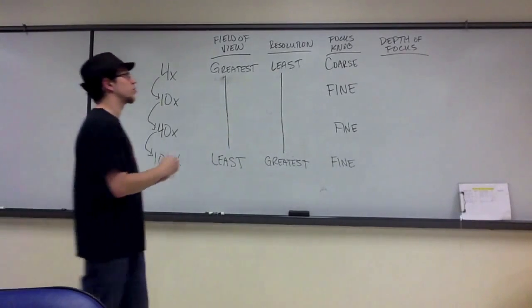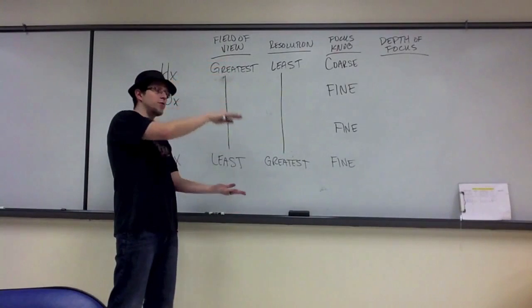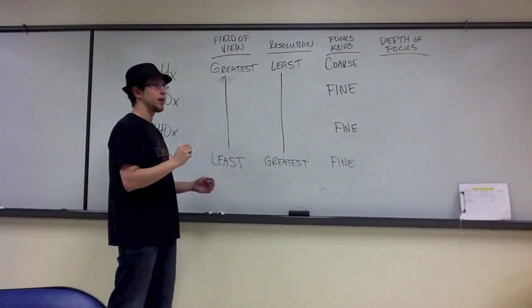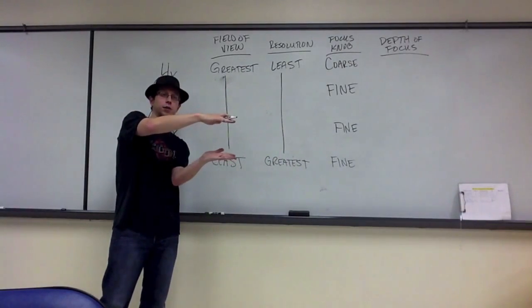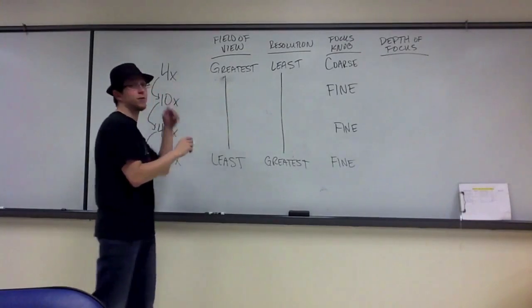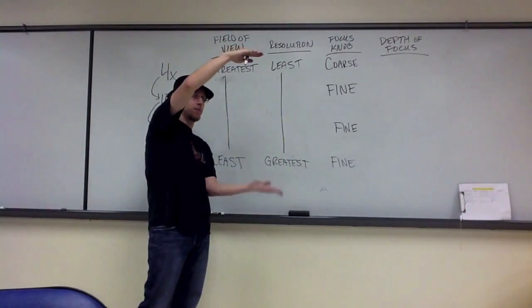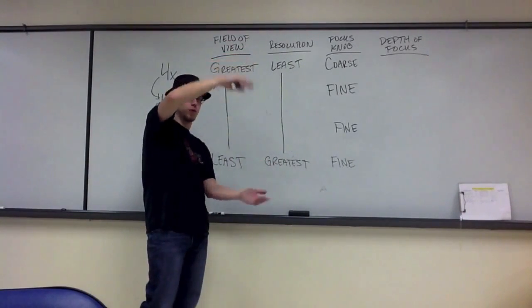Now, depth of focus refers to how much you can move through the slide and remain in focus. So the adjustments you can make to focus while still retaining focus. Okay? In other words, if you think about it, your samples aren't sitting flat. They're actually occupying a 3-dimensional space. So there is some area within that space that you can move using the magnifying lens that will still be in focus. But what depth of focus is asking is how great is the upper and lower limit of that focus, where our sample will still remain in focus.